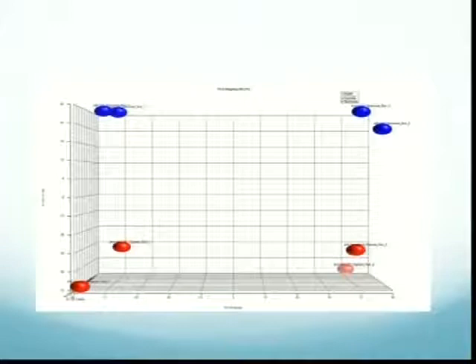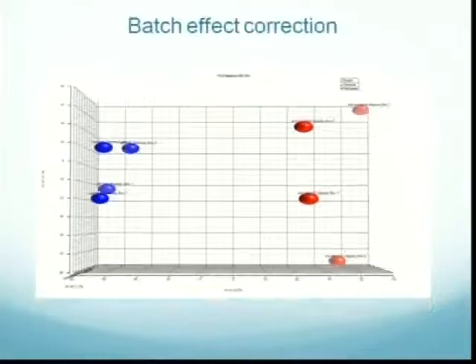It's called batch effect. It's this idea in high throughput genomics that you can have everything the same, but if you prepare the library in a different room on a different day, whatever phase the moon is in, you get changes in what are called batches. And thankfully, there is software that helps you correct for this batch effect, and when we apply the batch effect correction, normoxia and hypoxia become the most important discriminator between the samples.